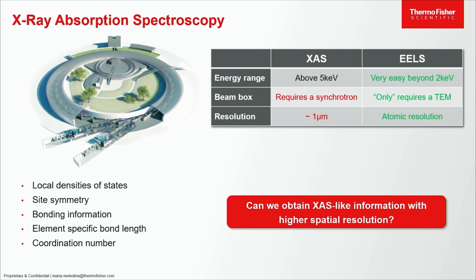And this all actually inspired us to think, okay, can we also enter the X-ray absorption territory? Can we maybe play with stuff which the synchrotron people are doing? And this was also inspired by a sample we were looking at, some glasses with crazy compositions and a lot of precipitates in them. And they were wondering if all the precipitates are the same or not. The guys also had some measurements from synchrotron, but they were averaged because they simply didn't have the spatial resolution. And we started playing with it and thinking, can we do the same with EELS?